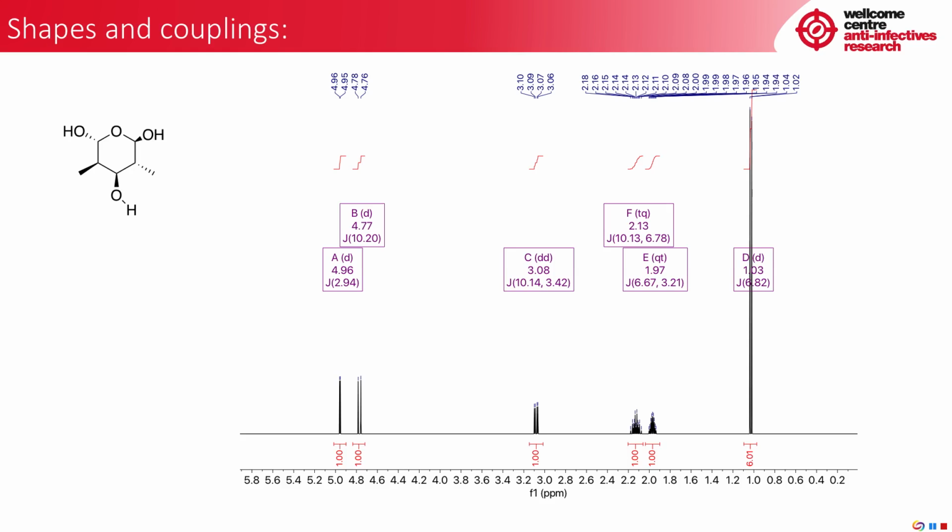So now for an example to demonstrate the values of J couplings and shape in structural determination. I have no idea if this molecule actually exists. There is one reference for it on SciFinder, and that's a 2010 patent on electrochemical energy storage. That doesn't actually matter because the spectra is simulated. So what can the spectra tell us about the arrangement of our atoms in space?